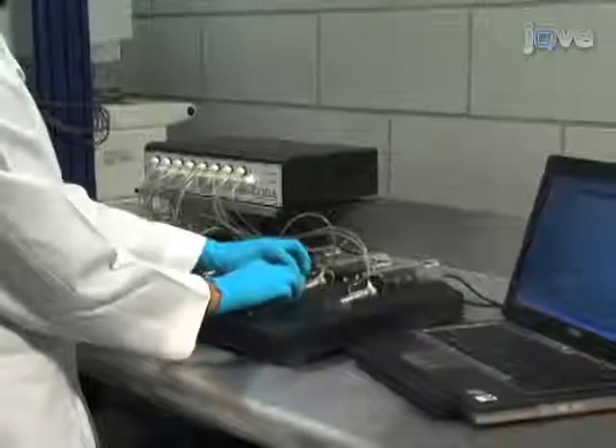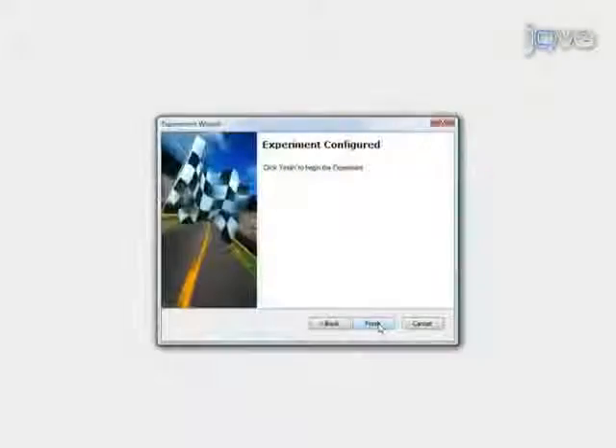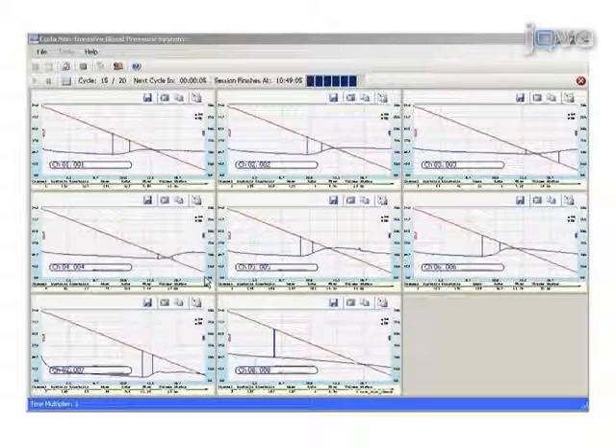Now that the animals are ready, click Finish to begin the experiment. The red line represents the deflation of the occlusion cuff and VPR sensor cuff. The blue line represents blood volume changes in the tail. The first inflection of the blue line — minimum rate of change — identifies the systolic blood pressure. The second inflection of the blue line — maximum rate of change — identifies the diastolic blood pressure.